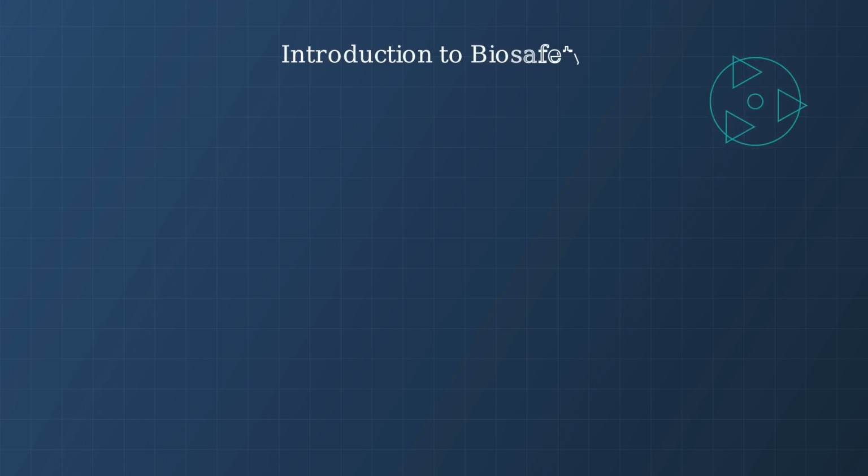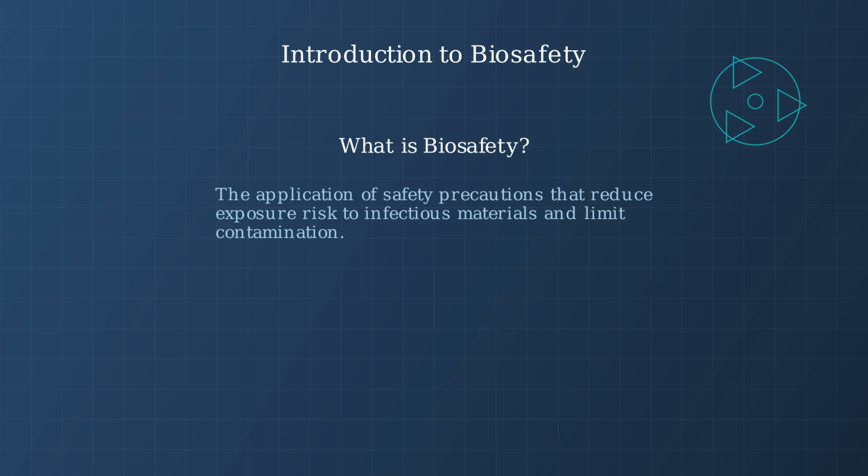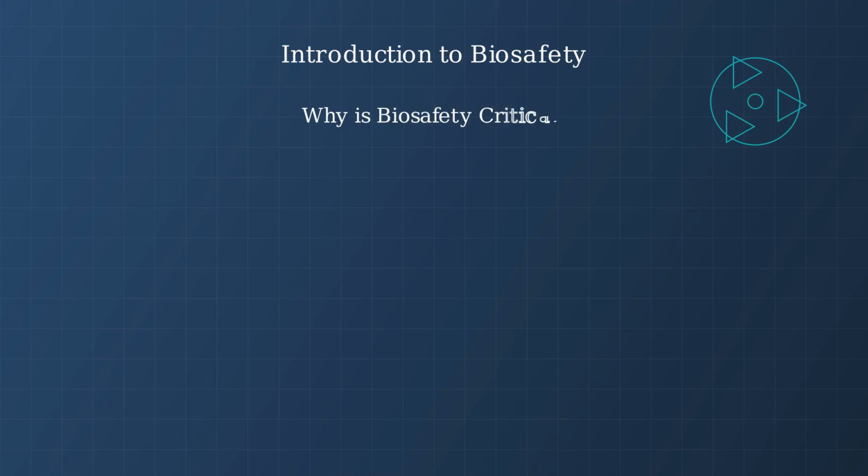Biosafety is the application of safety precautions that reduce the risk of exposure to infectious materials and limit contamination in laboratory settings. Biosafety protocols are critical in laboratory settings to protect three key elements.